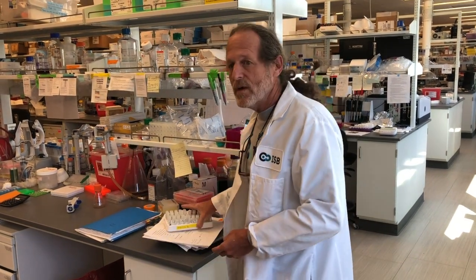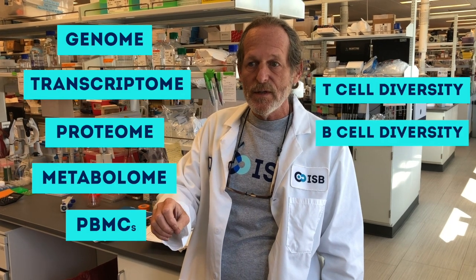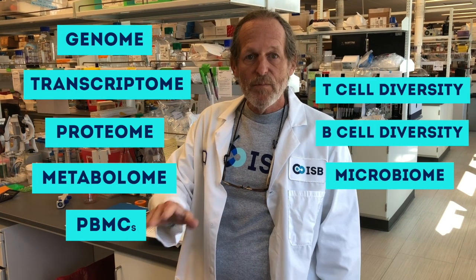And out of that whole blood, we're going to measure your genome, we're going to measure your transcriptome, we're going to measure your proteome, we're going to measure your metabolome, we're going to measure your PBMCs, we're going to look at the T cell diversity, the B cell diversity, and we're going to look at other biospecimens as well, such as the microbiome. But today, I want to talk to you about how do we ensure that when we do those measurements, they're high quality.